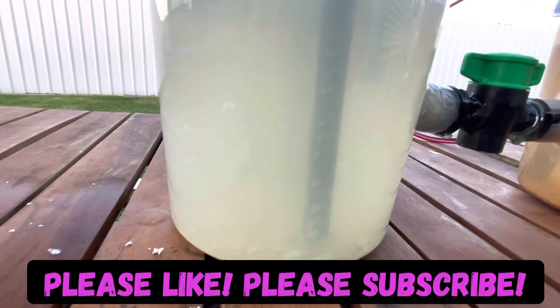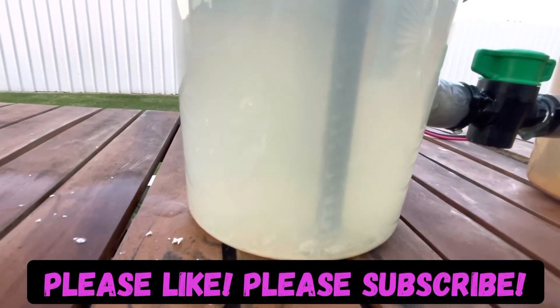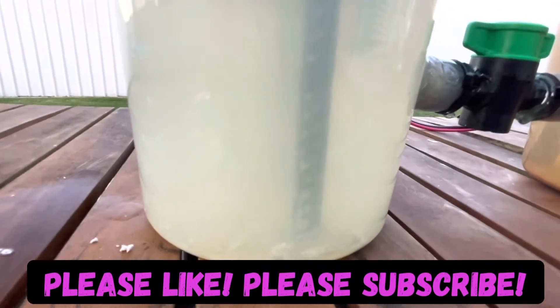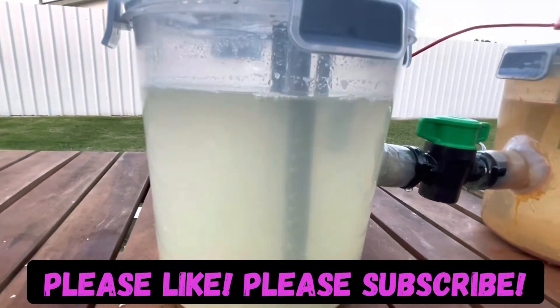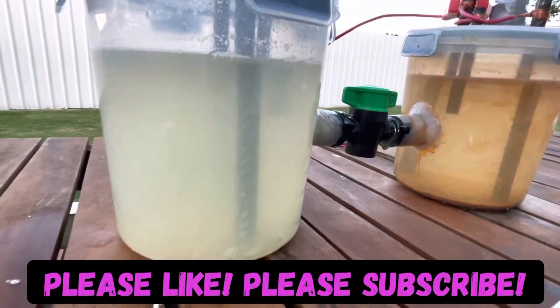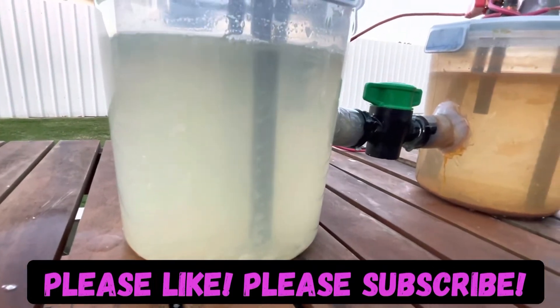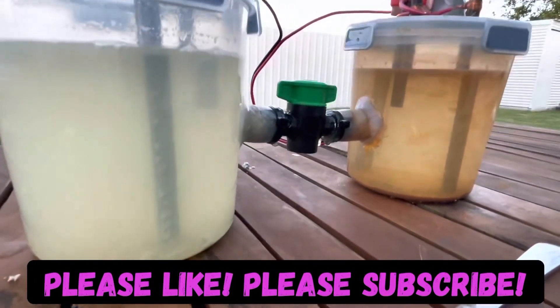So it's still very saturated in salts. I left it overnight to see if it would blend and it has not blended — so it was another failure. At this stage the only thing I can do is let the process run longer.